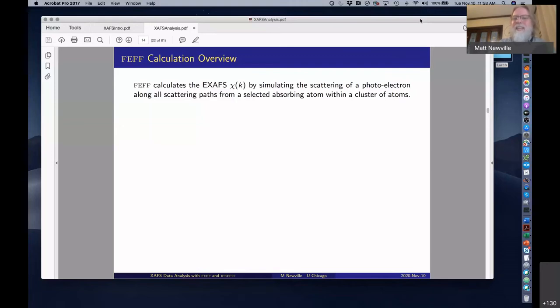For the data, it can go spectacularly wrong. You want to make sure that you're consistent in what you have for the data. Other than that, it shouldn't be wandering around a lot as you do fits, unless the data is noisy and you kept bad fits.